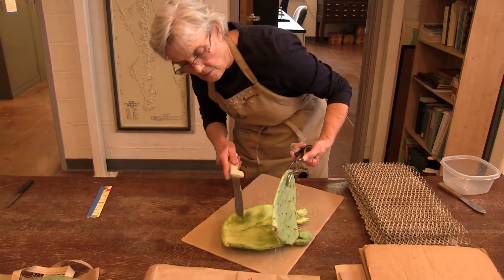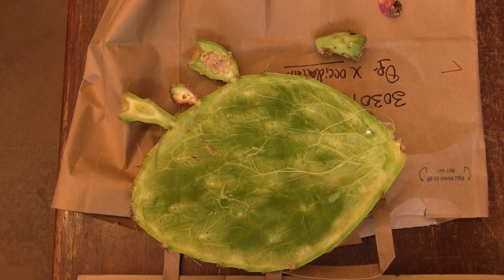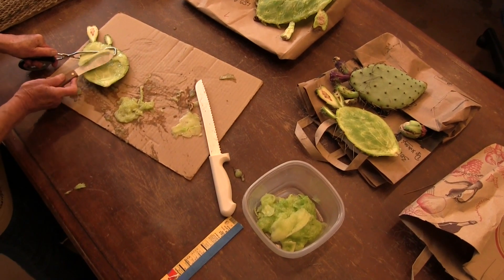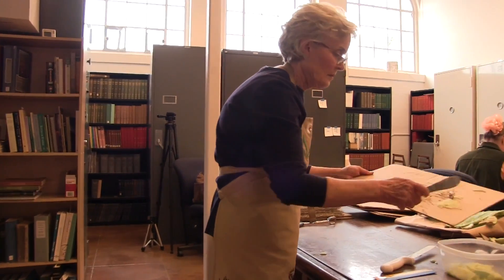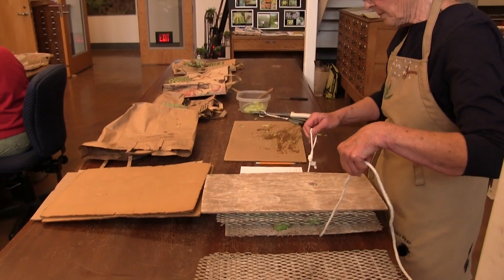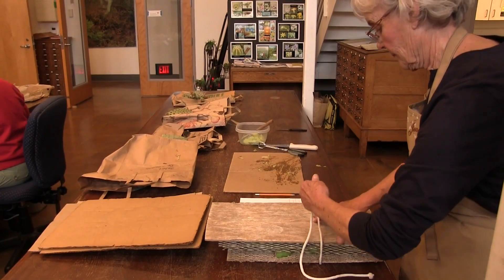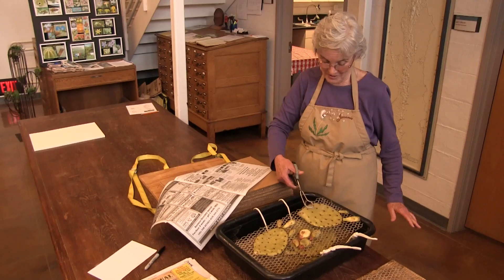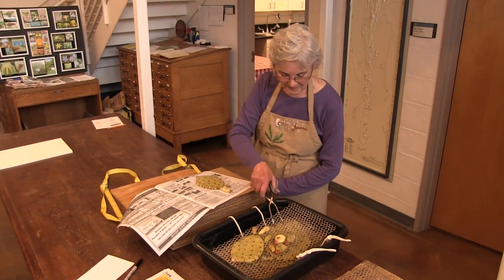When they come in they're very wet and we have to slice them open, scoop out the inside, and get rid of all the moisture we can without damaging the specimen. Then it goes into an alcohol bath which pushes out the water, and then we put them in newspaper and dry them in a dryer.